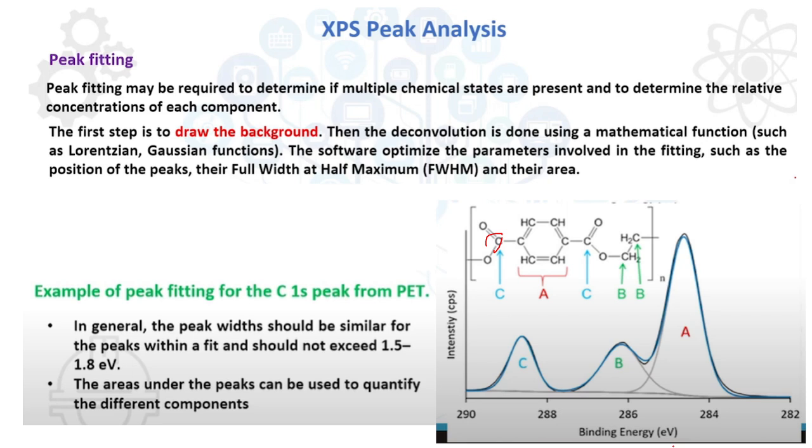So is it understood how the binding energy, and why it is so authentic, and how you can get the exact data from XPS, or assure whether it is forming any covalent bond or interacting with something or not? You see only 284 to 287, a 3 electron volt energy gap, but it is clearly visible.